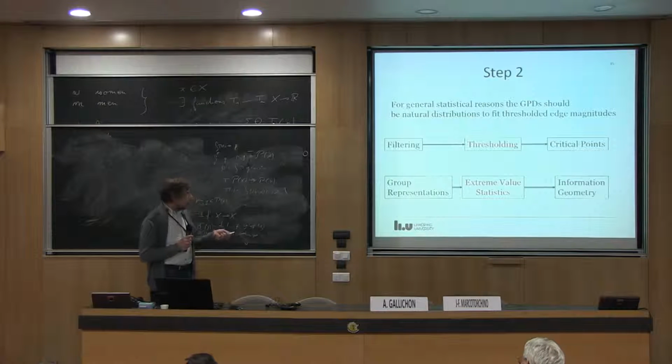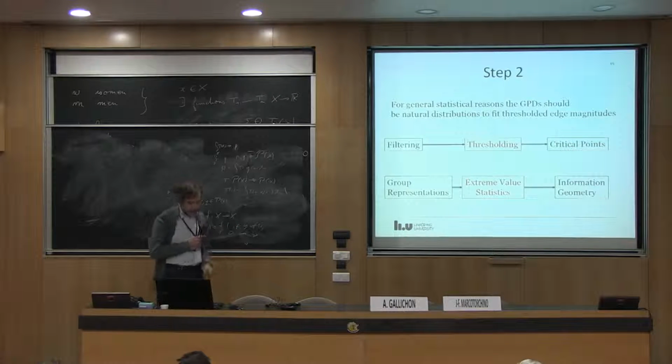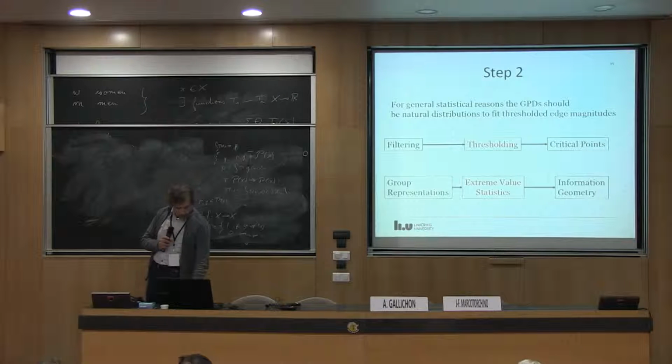So as a result, for each image, for each focal position, you get a Pareto distribution, which means that in the case of the autofocus sequence, you get a curve in the manifold of the Pareto distributions. And now, can we use this information?